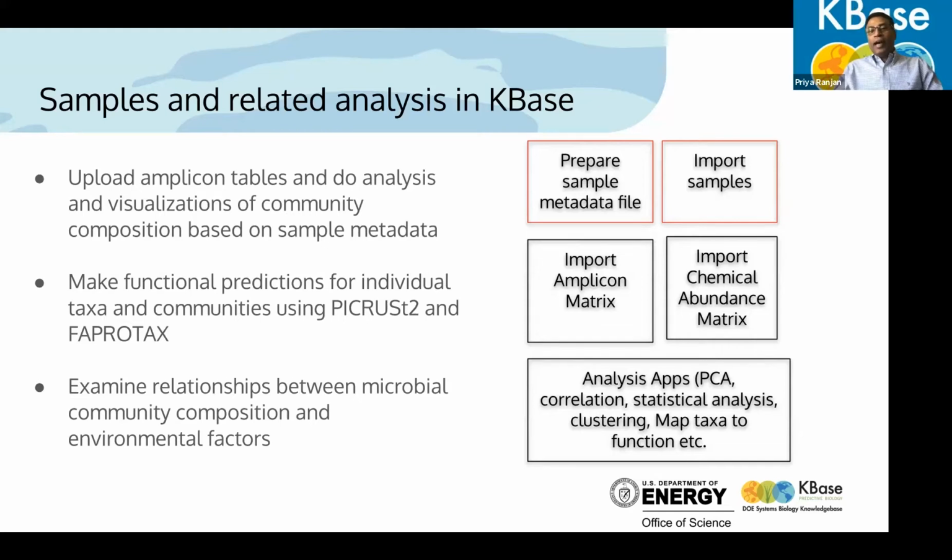But in future webinars, you can see how to import amplicon matrix, chemical abundance, and a whole set of cool apps to do statistical analysis, PCA, and get insight into the data. But the cool thing is all the data and the analysis are linked to samples. So for now, it gives you a great way to look at the data and also include the sample metadata in your analysis, but also see how your data is organized.